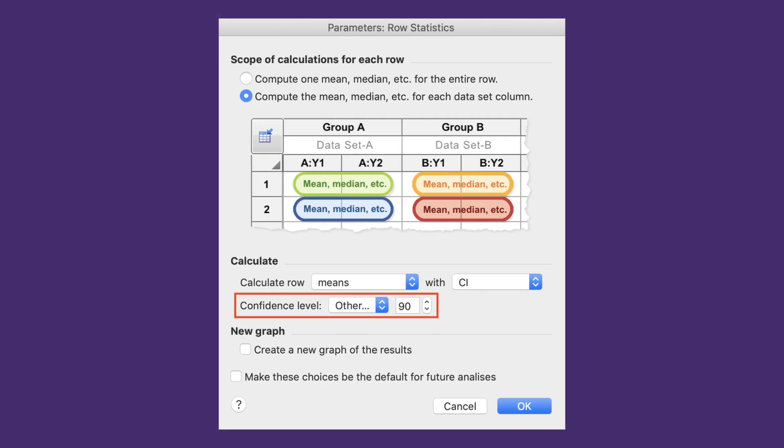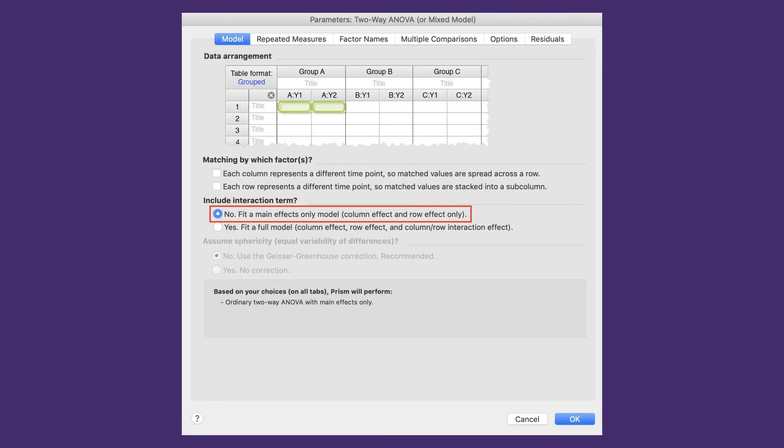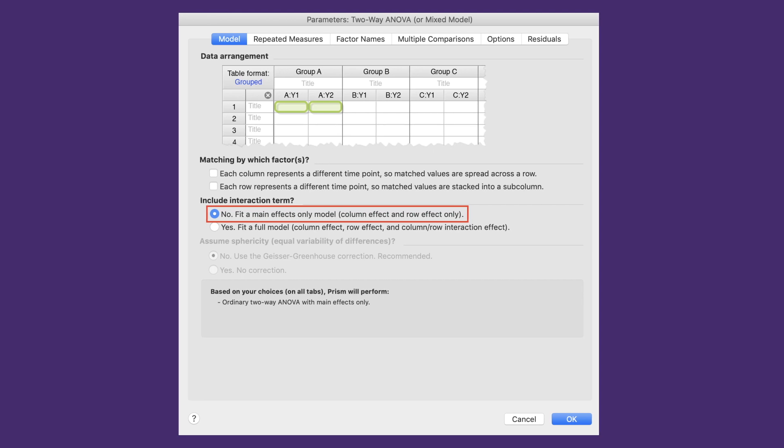Other enhancements to existing features include row statistics, which allows for calculation of means with custom confidence levels, and two-way ANOVA, where main effect-only models are allowed. With this feature, you can perform two-way ANOVA with no data at some row-column combinations.